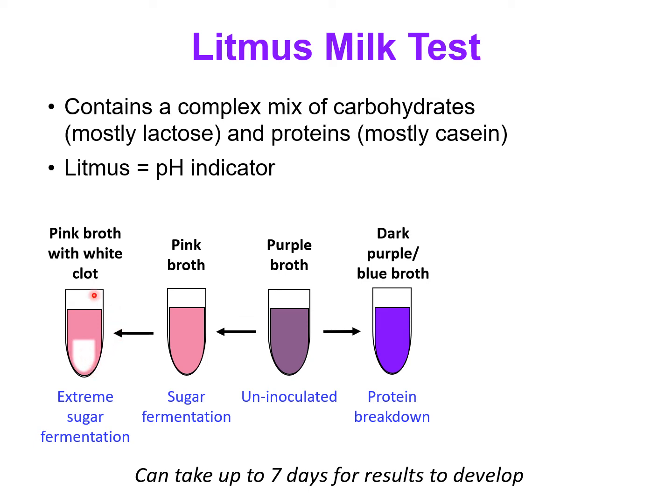So this kind of result right here, as I said, is after you've incubated this test tube for a bit longer. It could take up to 7 days for your results to develop. So within the first day or two, you will see some change, and then if you leave it longer in the incubator, you might actually see more change.